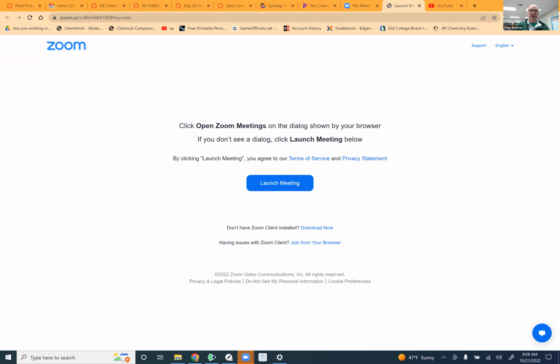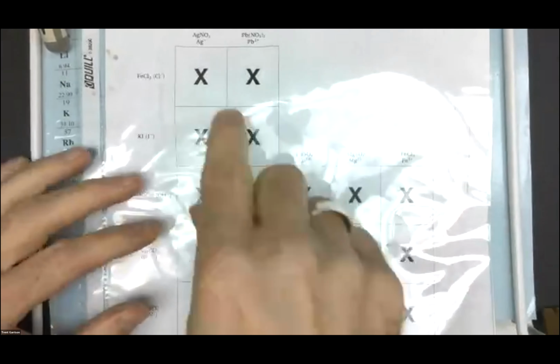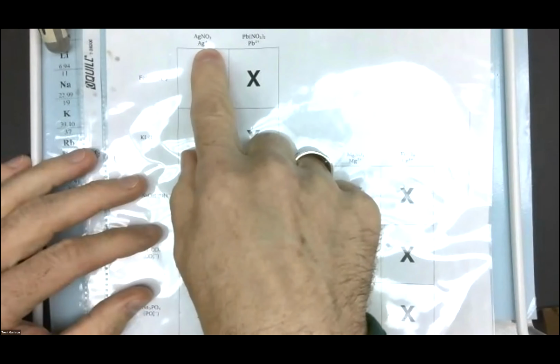It's on a chart, a data table. So I'm going to switch my camera over to that scenario so that you can now just see what's going on with the camera here. And you'll see the chart. It's got a table and or some kind of a matrix, if you will. And each one of these different X's has in front of it a different labeled material.